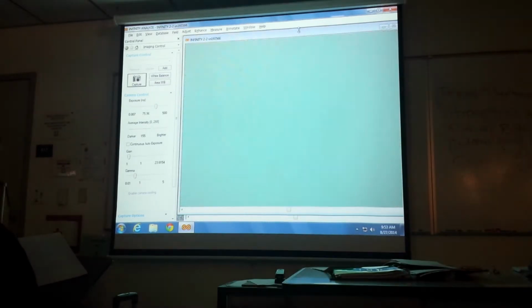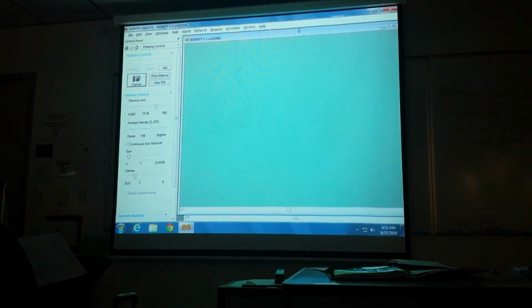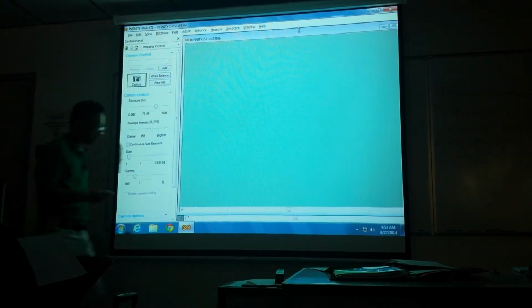Actually, I'm going to get a better slide. This looks kind of frustrating.